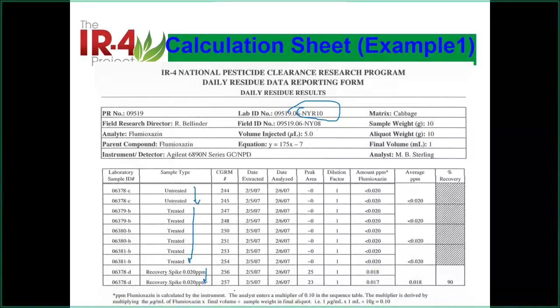So this is meeting the requirement we just talked about, the double injection. You will see this is double injection because it is right after each other. It's not like you analyze the first time, and after several injections, analyze it again. That's not called "double injection" because it's different. It's not our IR4 requirement. The IR4 requirement is that double injection is inject right away, then the next sample, injection right away. So they are doing the good thing here.